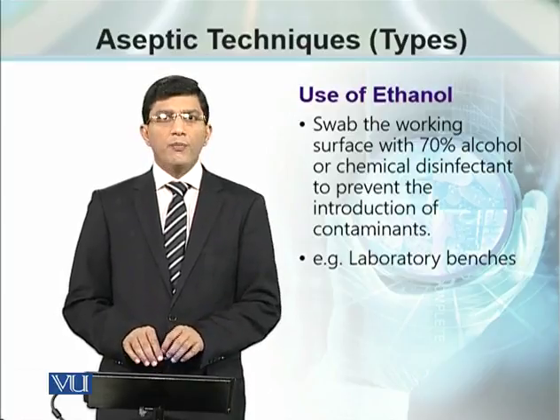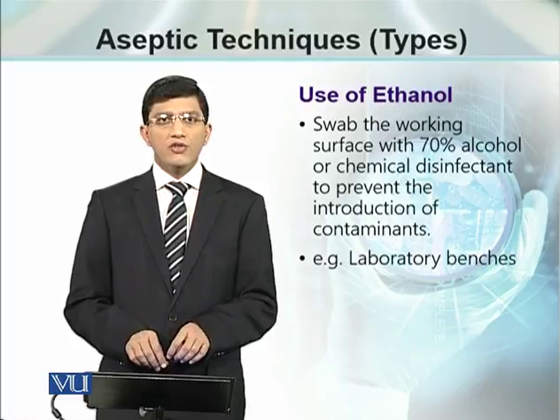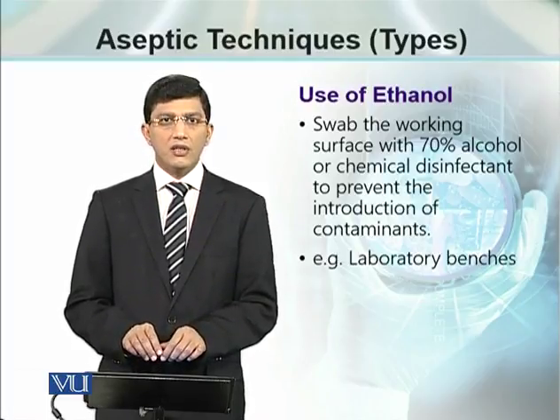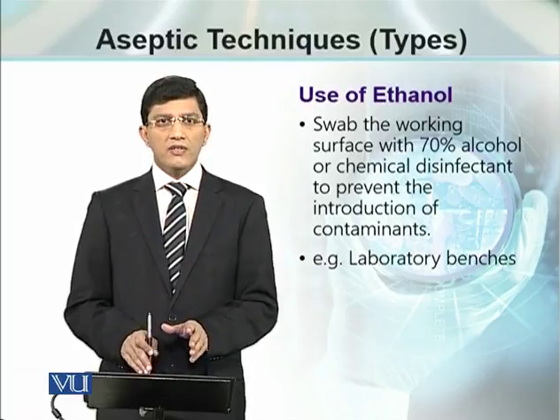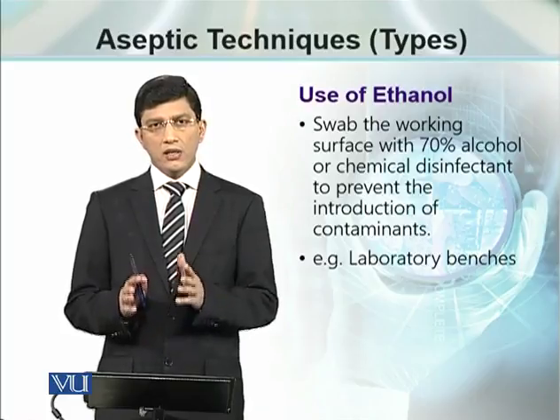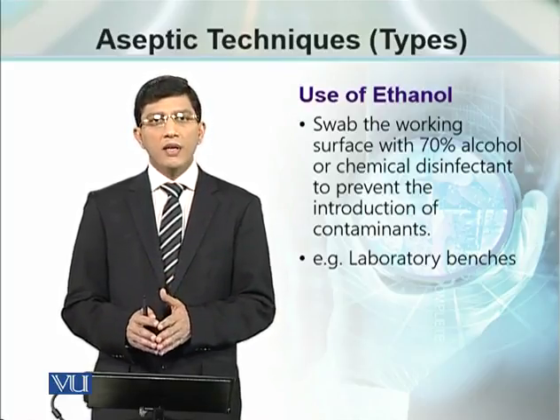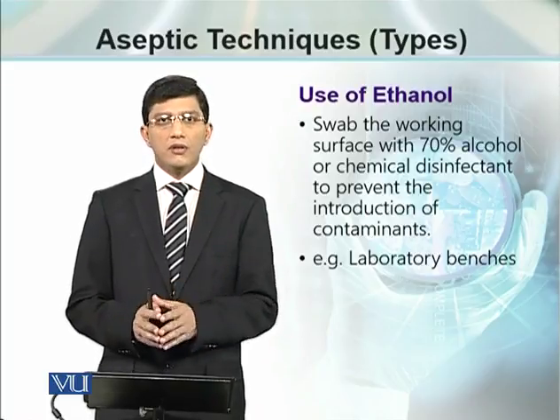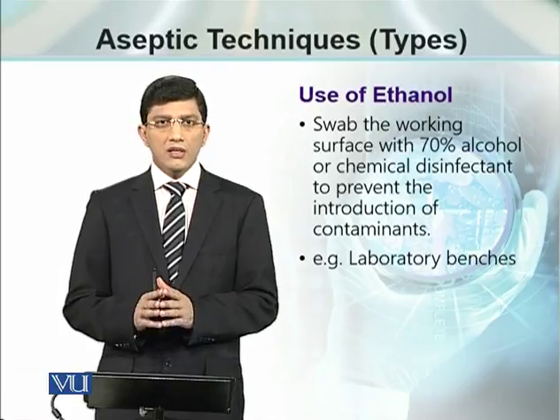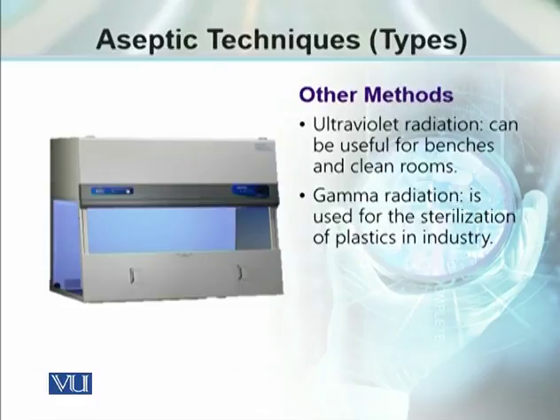When you work in the lab, you work on different benches. These are quite big in size. So you may need to clean these places using 70% ethanol. So always start your work and end your work with this procedure. Clean the space with 70% alcohol before you start and clean it after completing your work. It will ensure the sterilization of the working area.